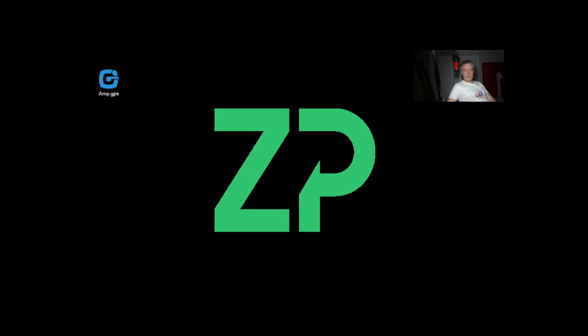Hi, welcome to this short video, because what I'm going to talk about here is the uploading of Galvanoplot potentiostat data into Djuli. Djuli is a data management system that's specifically tuned for electrochemical data, and Galvanoplot is a low-cost potentiostat system. It's not from ZP, it's from a third party, but the nice thing about Djuli is it can allow you to upload data from PalmSense, Autolab, CH Instruments, Galvanoplot, and as we discover new instruments, I should also add Zana as well, as we discover new instruments and make Djuli able to deal with that.